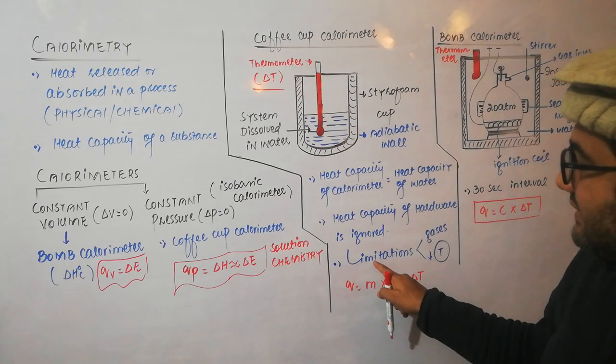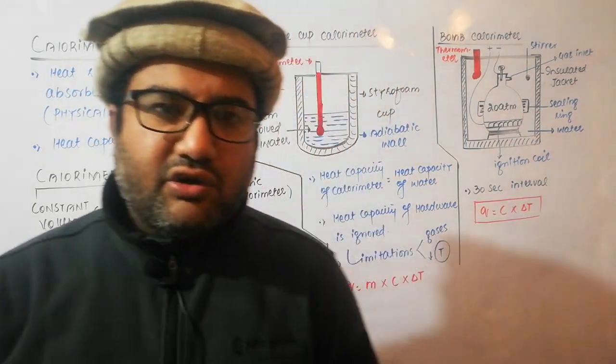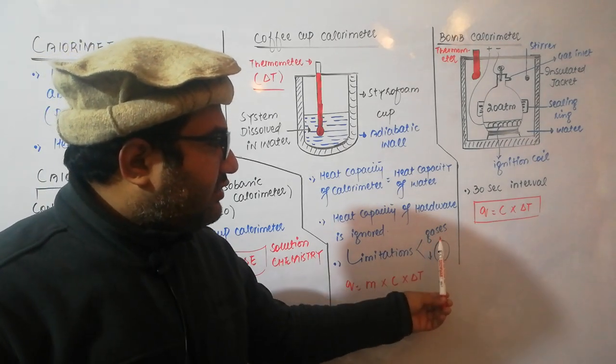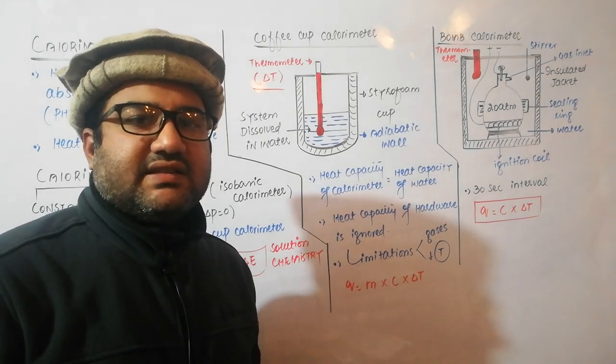Now, there are some limitations of the coffee cup calorimeter. This calorimeter will not be applicable if the substance we are going to study, or the reaction, or the change we are going to study, involves gases, because the gases will escape the calorimeter.